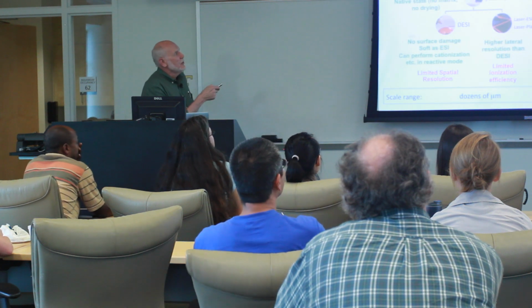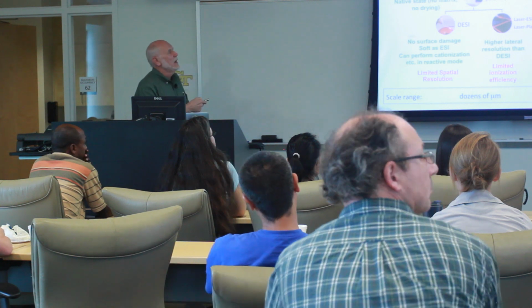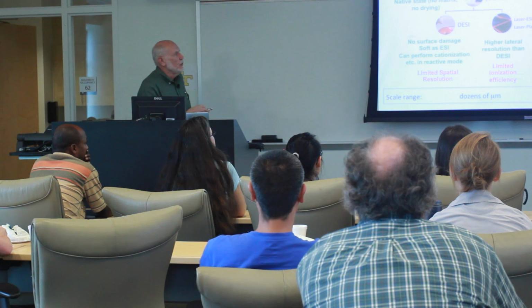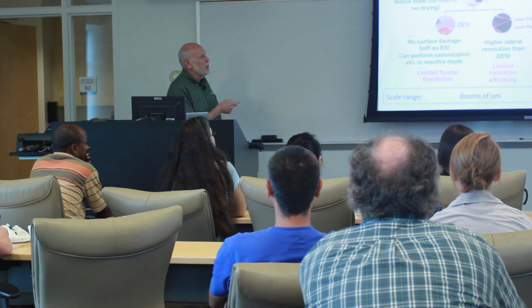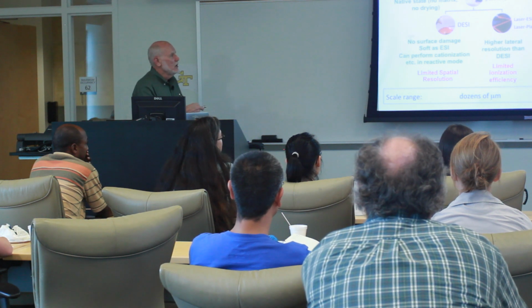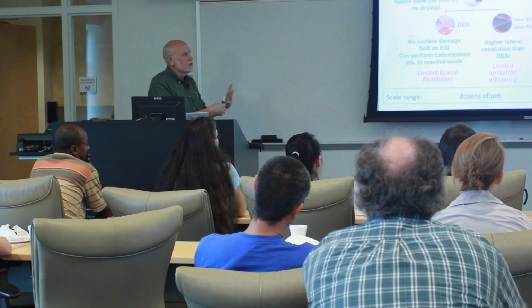There are two ways that the samples can be gotten into the mass spectrometer also that differ somewhat fundamentally. One you've heard a lot about, which is using vacuum as a method to bring the ions in, but you can also collect samples with ambient conditions. And Facundo has differentiated these two approaches very nicely in this summary slide, talking about the advantages of the DESI type ambient approach, where you're spraying a solvent onto the sample and releasing molecules off the surface. Very good for in vivo materials that are in their native matrix. And then going all across to what we talked about a moment ago in MALDI or SIMS, where you have to do a lot of sample preparation.